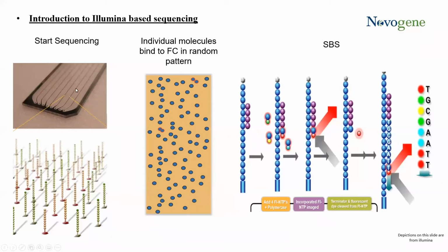On this lane, there is an oligo lawn. So this is where our libraries will covalently bind onto the flow cell. Now this gets back to right here. So we have bound, and in this case, in the HiSeq, we have generated clusters.